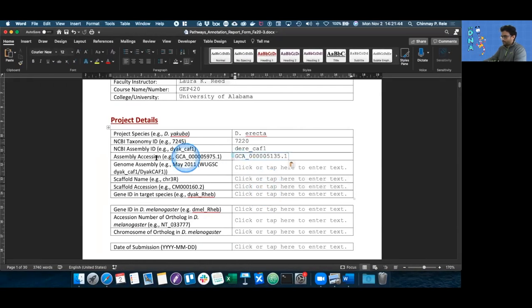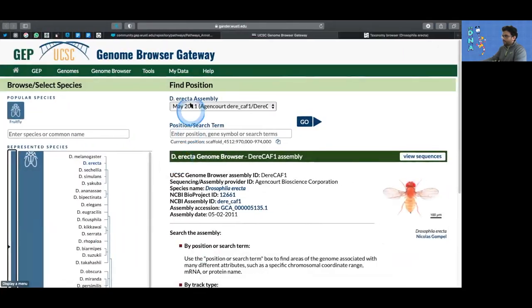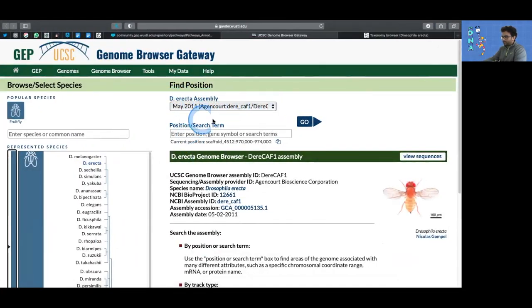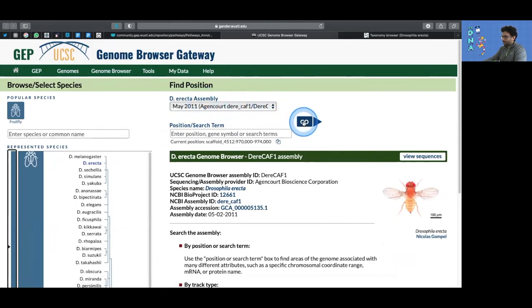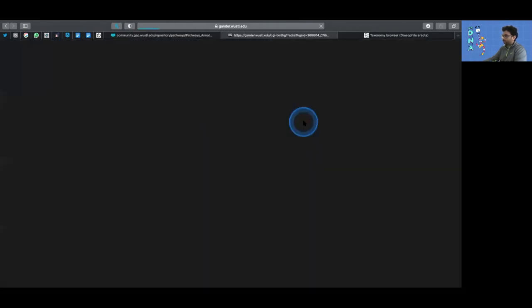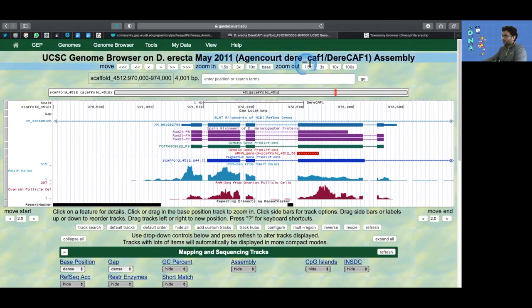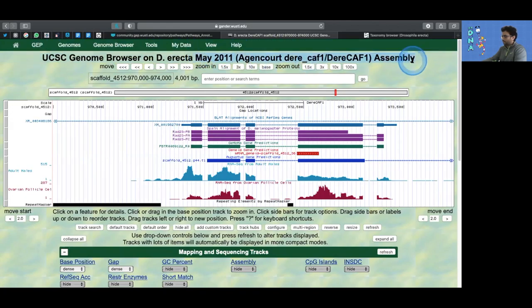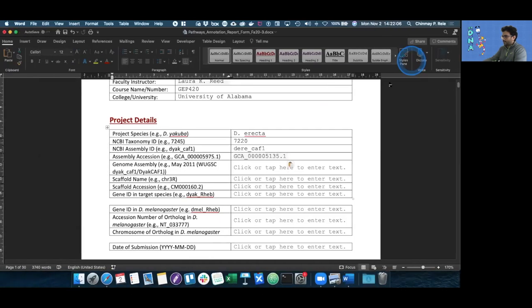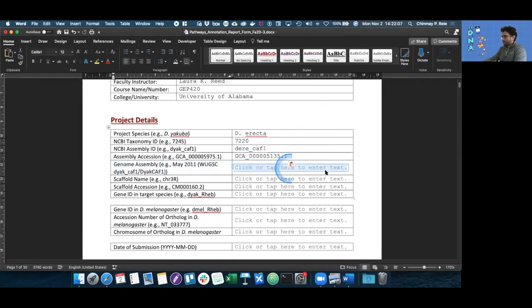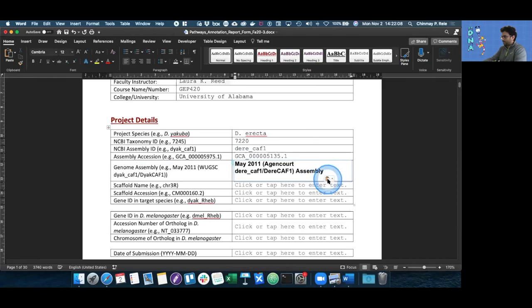Next, we need the name of the genome assembly that we are annotating in. You can tell that the name of the genome assembly is right there, but in this format we can't copy it. So we need to go within our assembly by clicking go. Then we can take everything that's after the name of the species, copy it, go back to our annotation report form, paste it, and as always, keep text only.